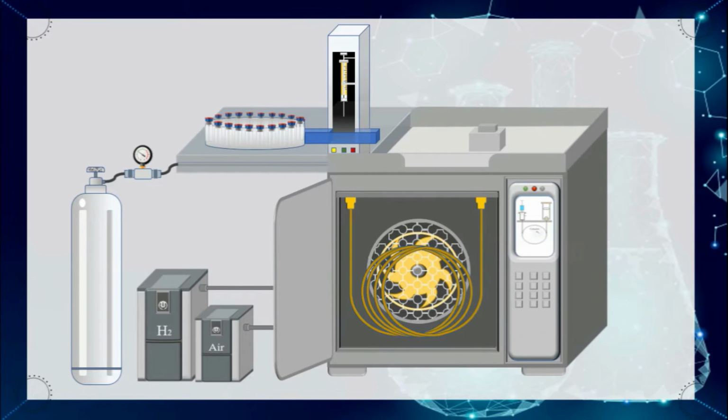It will then pass through the detector, and the recorder will detect, analyze, or quantify the components based on their retention time. So these are the important factors regarding the column chromatography, like column temperature, carrier gas flow rate, column length, and amount of material injected. These are the factors which will affect the separation of particles in the column.